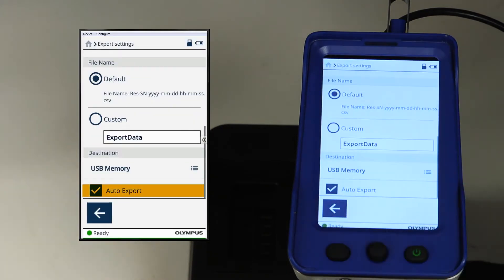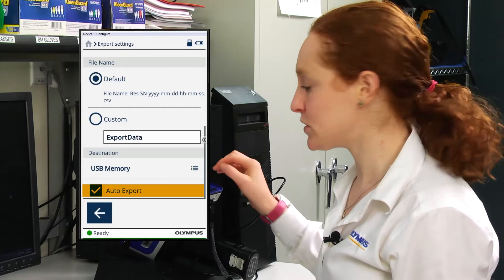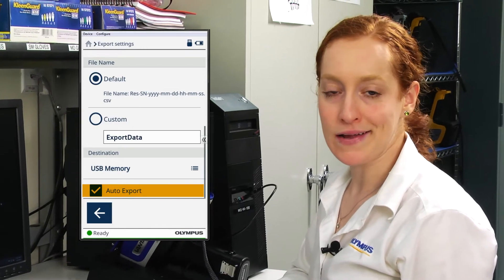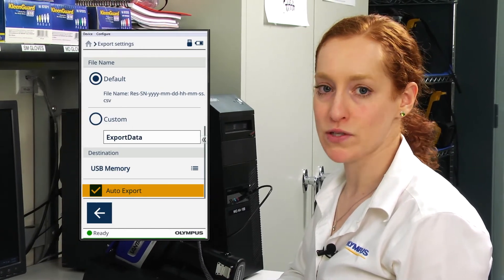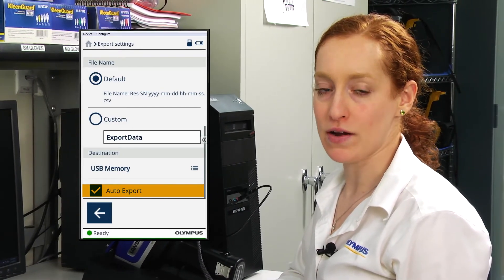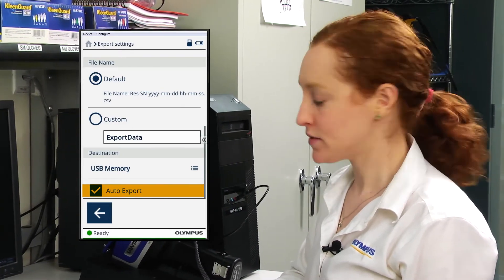A note about auto export. When the auto export box is checked, an individual result file will be created after each test.